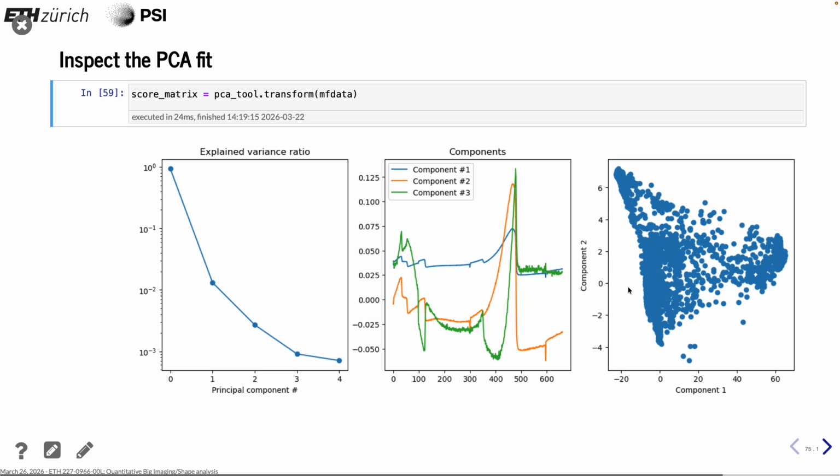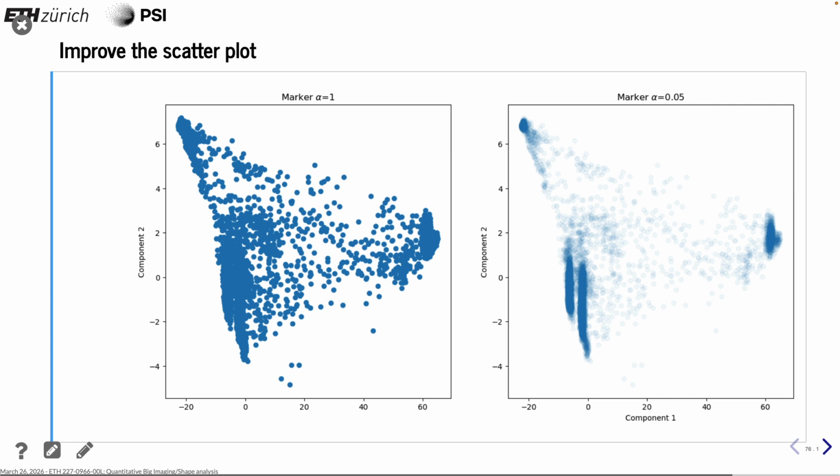If you have a plot like this, a trick is to play with the opacity, and instead of having this completely opaque cluster, you can start seeing that you have 4 distinct regions, and those can then be used to identify regions in the material.